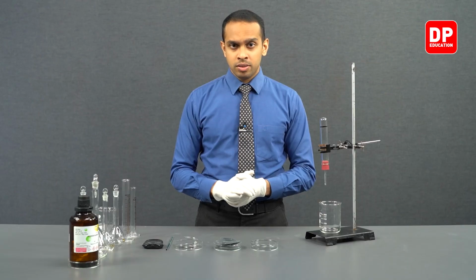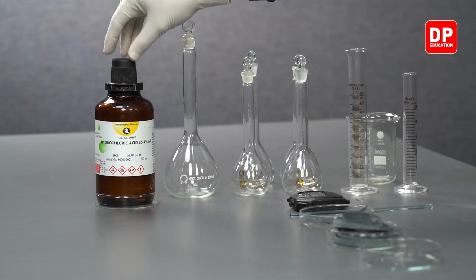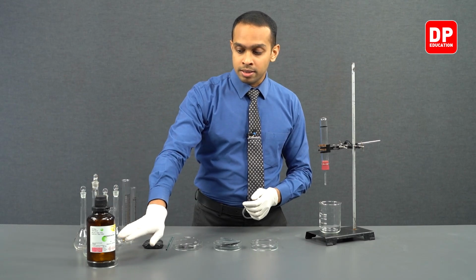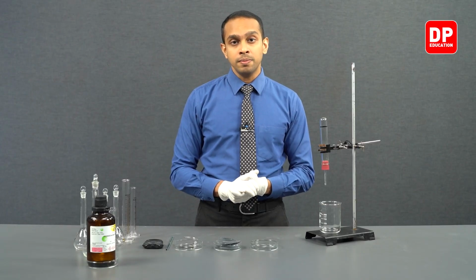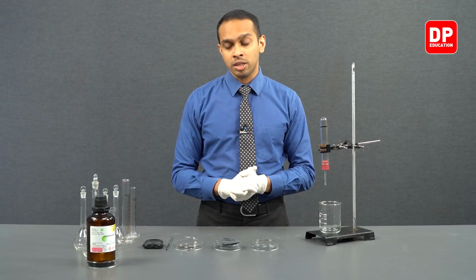Let's move on to identifying the reagents and the equipment we will be using for this experiment. Let's take a look at the chemicals and the equipment. We will be using hydrochloric acid. So we have the hydrochloric stock bottle here. On the stock bottle, you would normally notice its molecular weight, its assay, and its density. So we can use these values to form HCl solution with a very specific concentration.